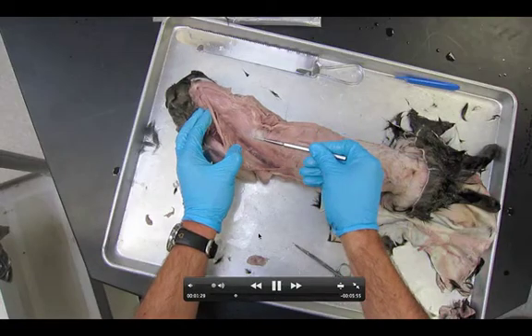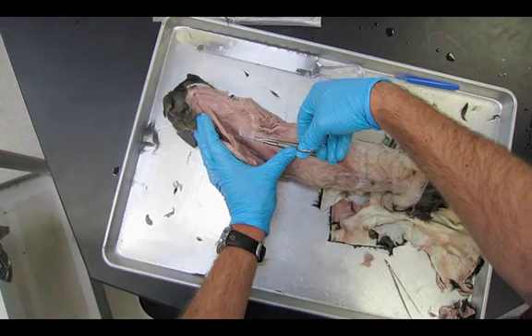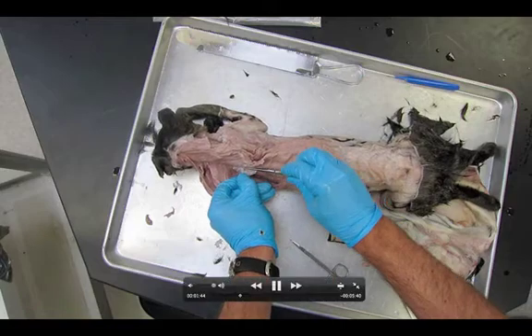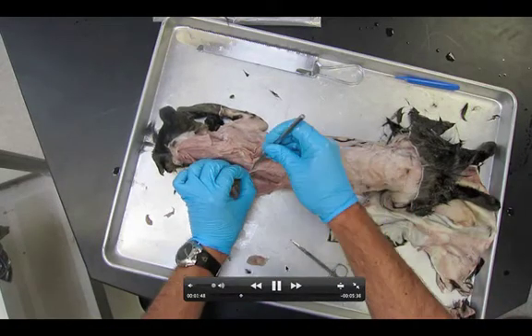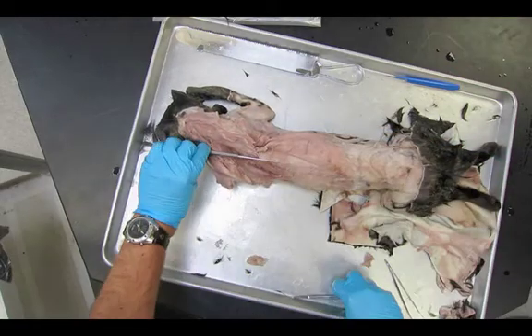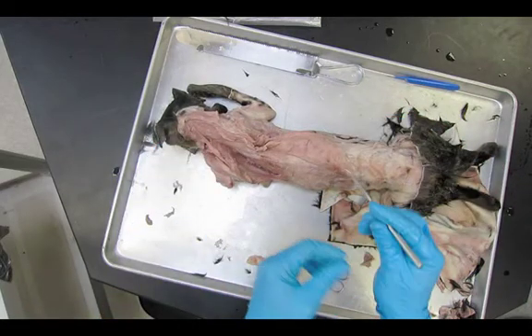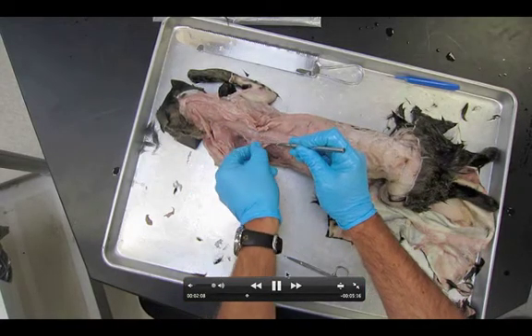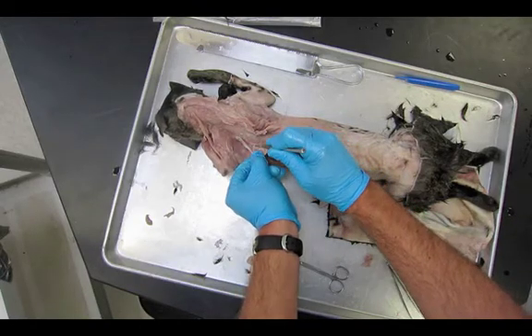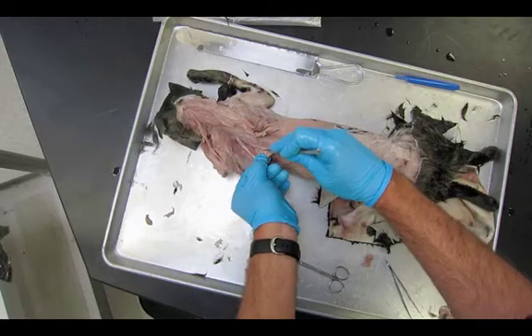I'm getting my scissors and probe. Using scissors, carefully cut through — this is the attachment point of the serratus dorsalis. Now I'm going to take my probe and go the other direction, peeling this thing down. I'm going to go the other direction and cut up this way. You have to be kind of delicate here; if you're not delicate you'll tear the serratus dorsalis. So just cut it carefully and then peel it down.